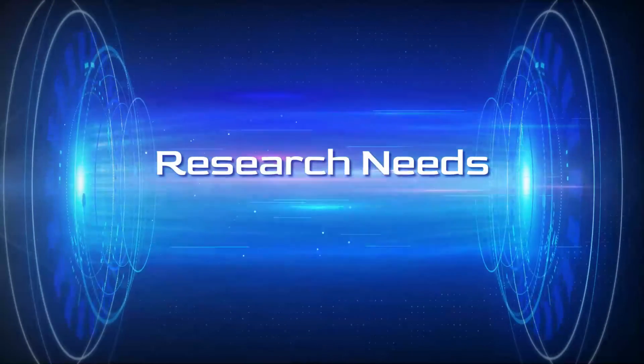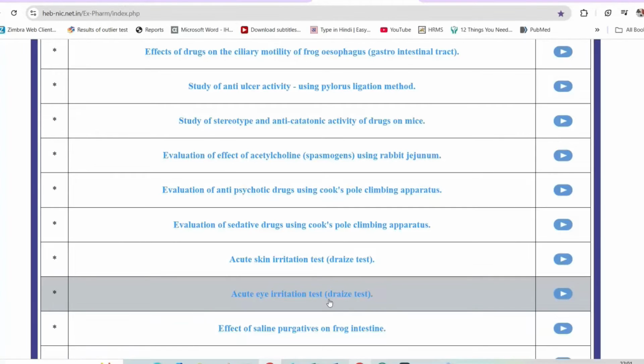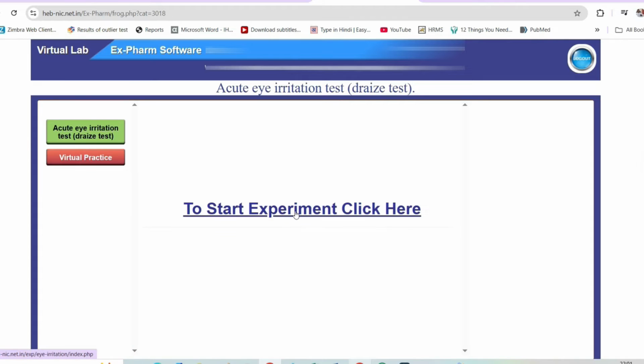In this video we will see the acute eye irritation test, the Draize test. We are going to see it using Expharm software. Here you can see the interface for the acute eye irritation test, Draize test. We will start the virtual practice, click here, and next we will start the experiment.